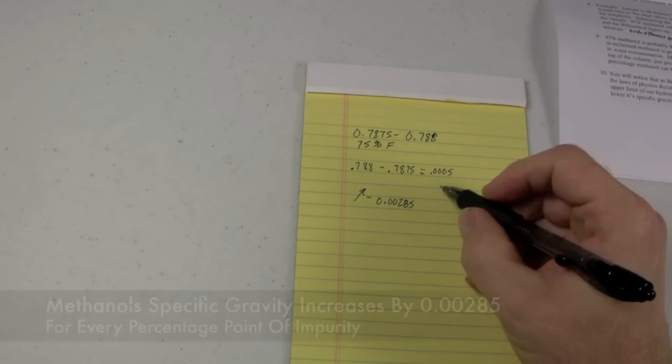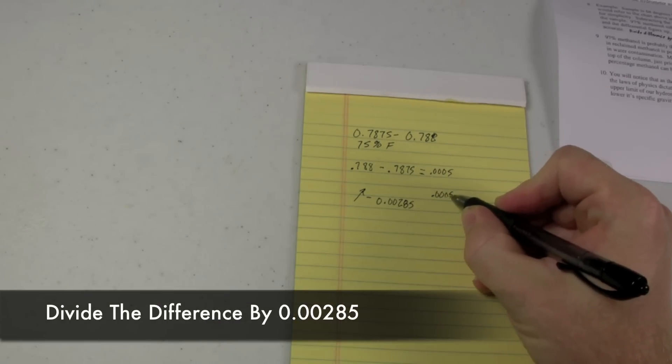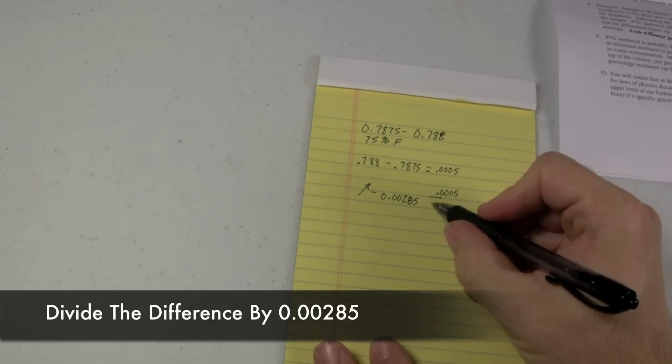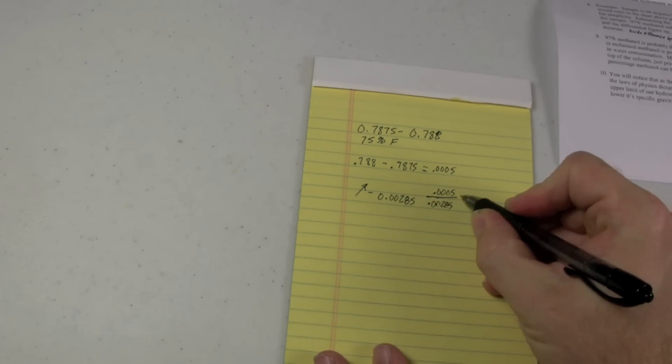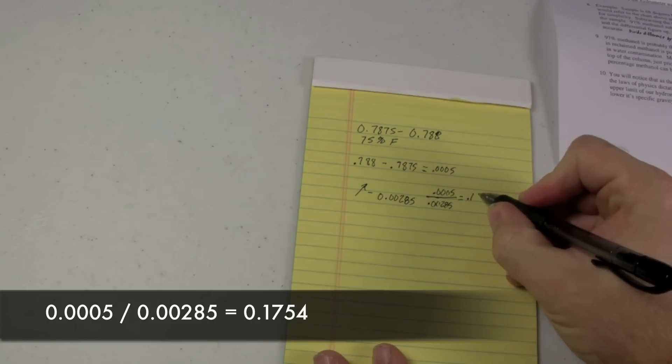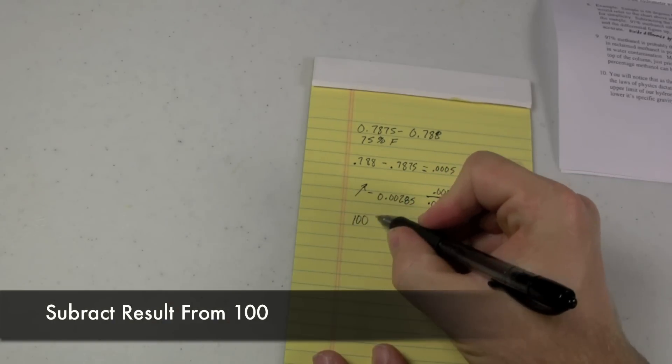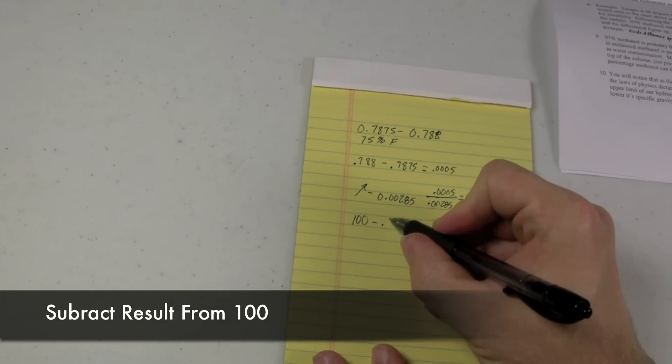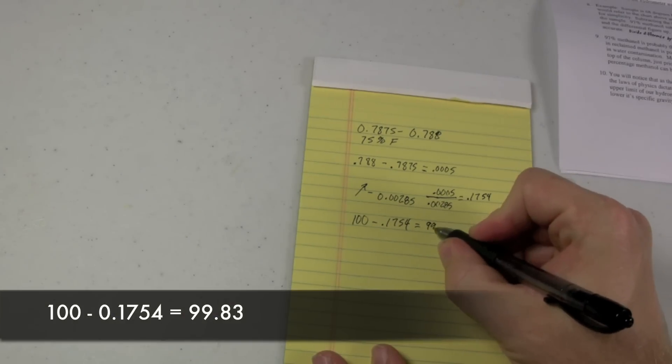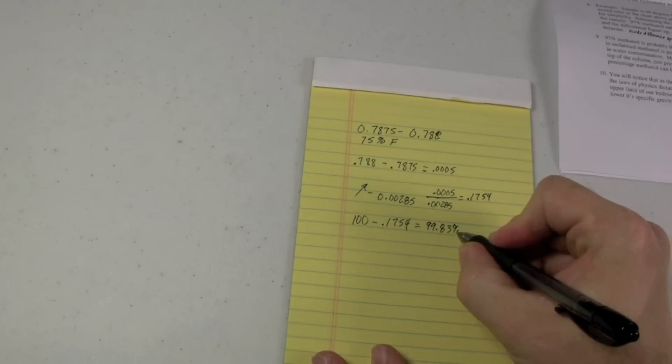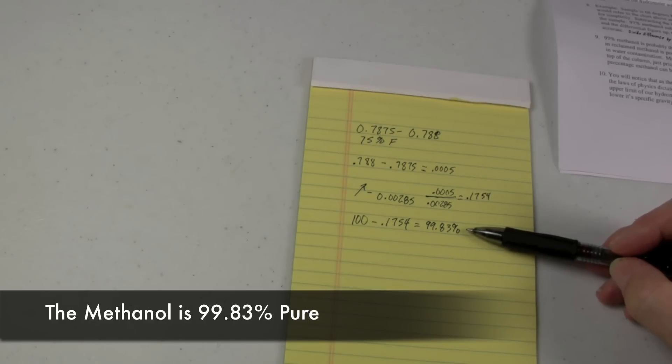So, we take, to figure out the purity, we take .0005, which is our reading, and we divide it by .00285. That gives us .1754. We then take 100, and we subtract .1754. That's going to give us 99.83%. So this methanol would be deemed 99.83% pure.